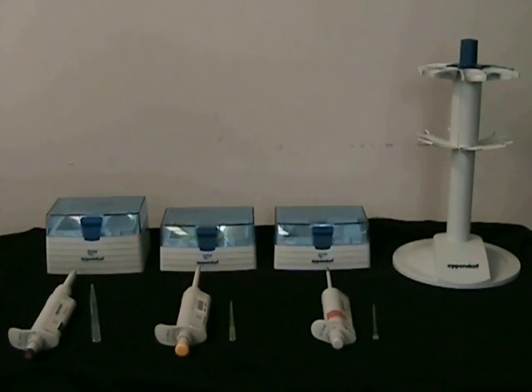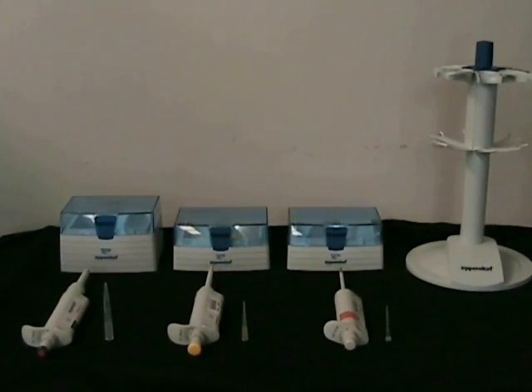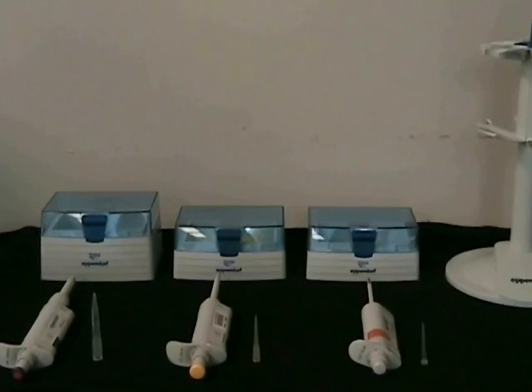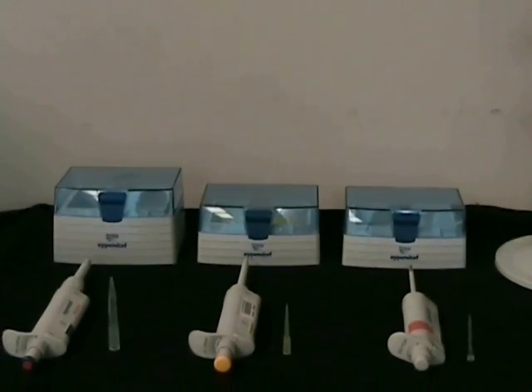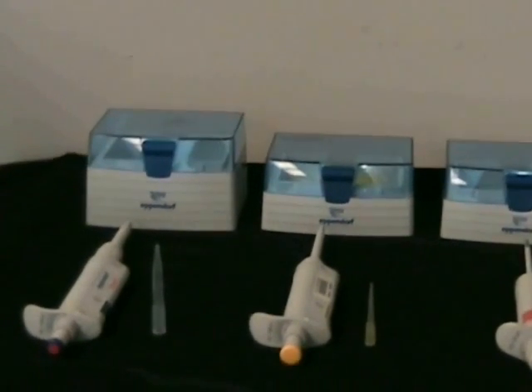In this video we'll be talking about micropipettes and microenvironment. It's imperative that at this stage in your career you learn how to prepare a perfect microenvironment because in the world of science, everything happens in 20 and 50 microliters.